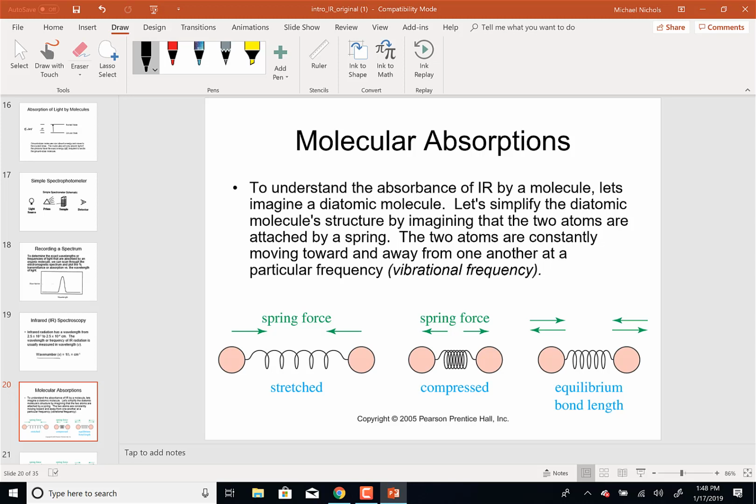And so that's the key in terms of us using infrared to tell us about functional groups. What we're going to find is on some particular parts of the spectrum, that's where you find the OH stretches. In another part of the spectrum, that's where you find the C double bond to O stretches. Oh, I can tell now if my molecule has a carbonyl or an OH.